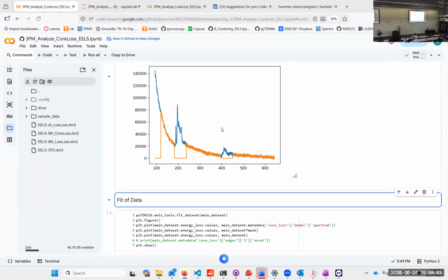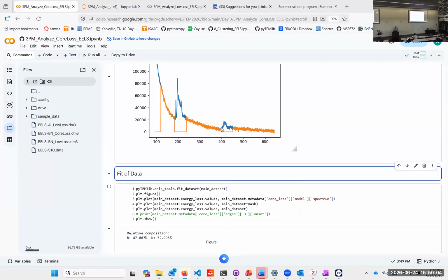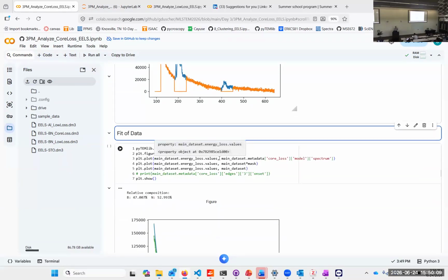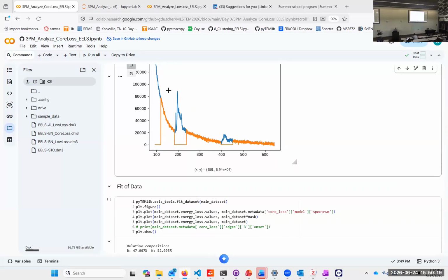So any kind of band structure effects will not be considered. Your bands are interacting close to the Fermi level, and so you have a very large deviation from your free atom, which is more like a free electron gas. Only after about 50 eV do you get rid of that. Let's look at the boron one. Is that enough?